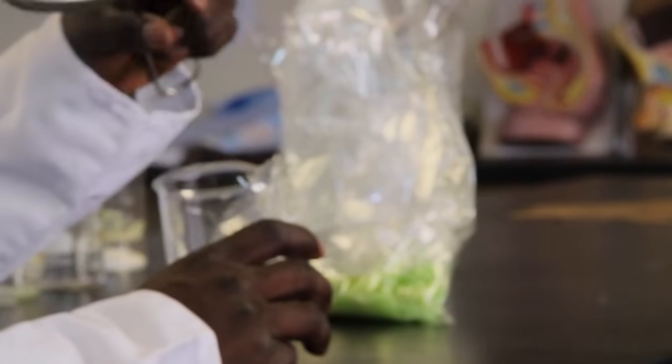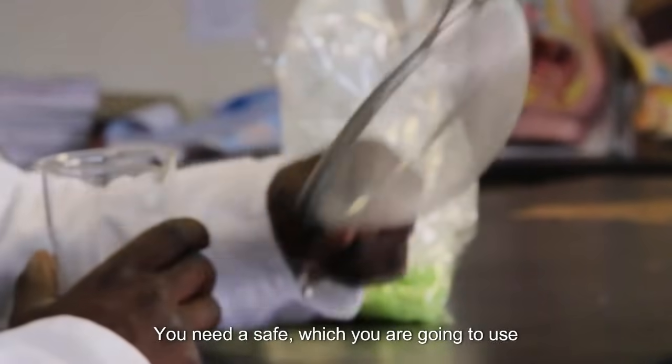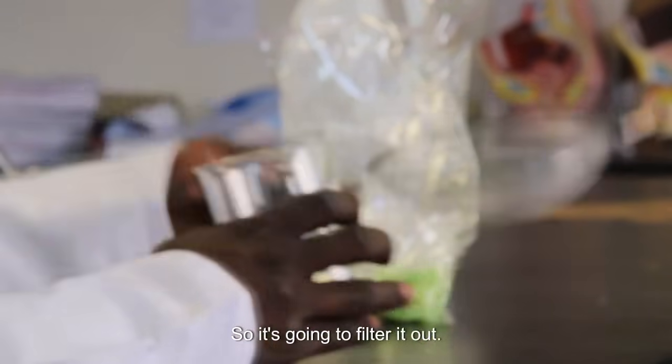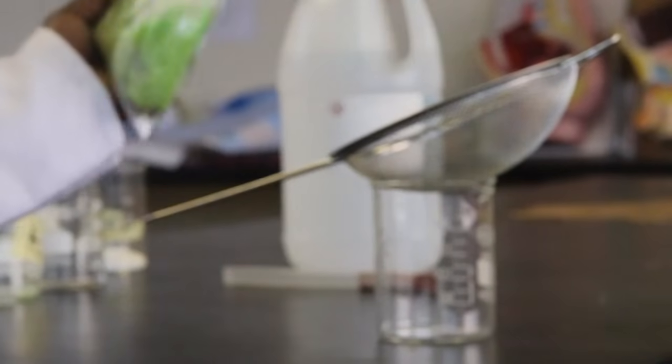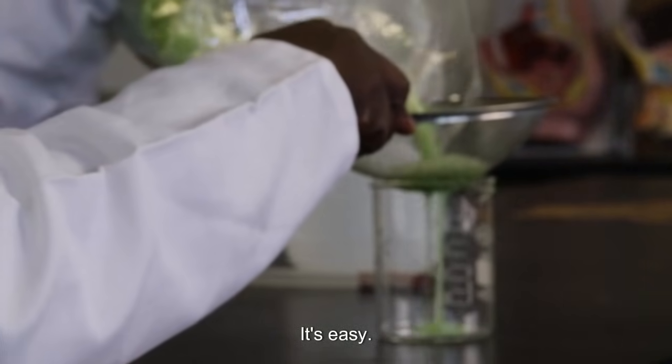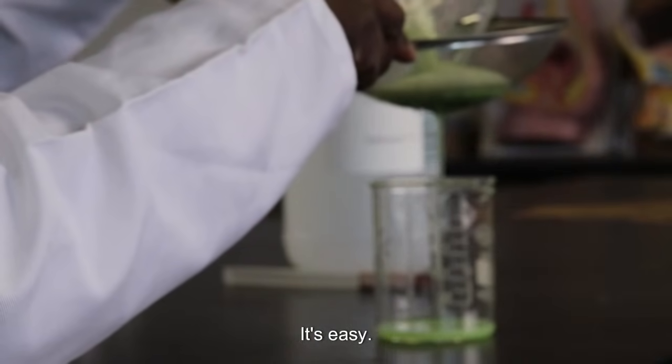So you need a sieve, which you are going to use to filter this out. So let's go and filter it out. So, concentration.